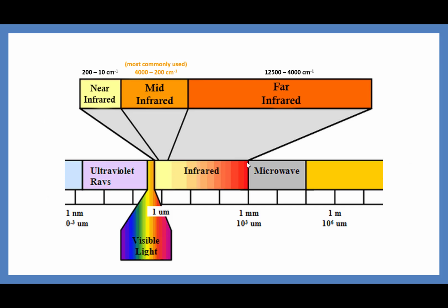So we're going to walk our way through some of the theory, so what actually causes these peaks to appear. And we're going to have a look at some of the instrumentation in this lecture.